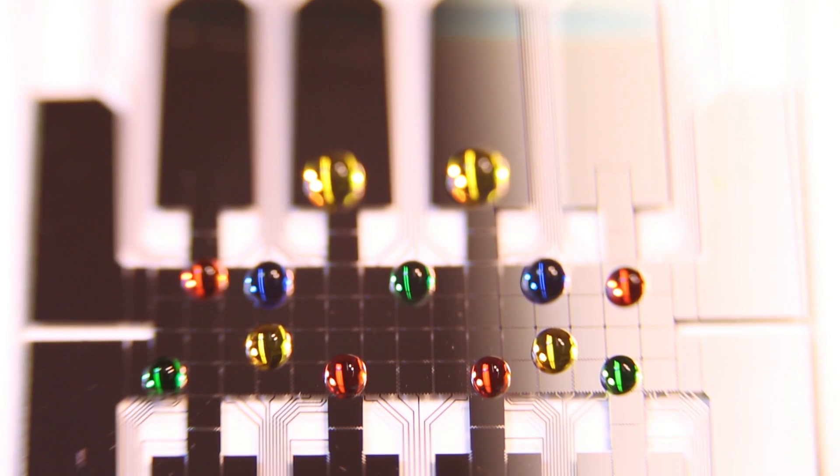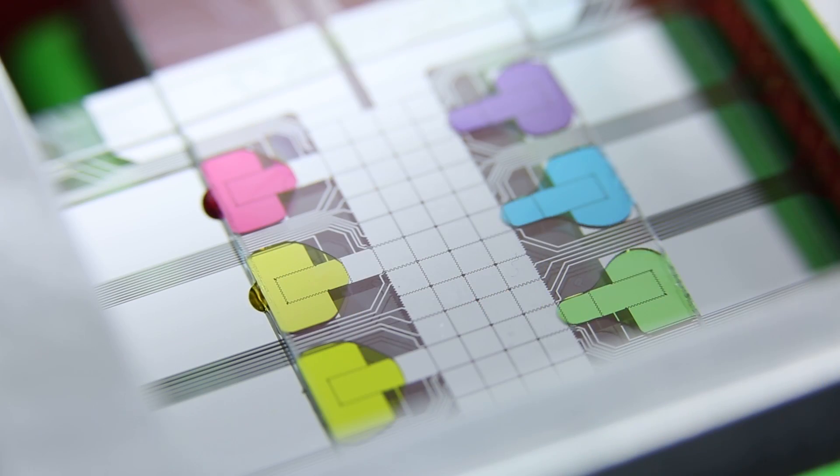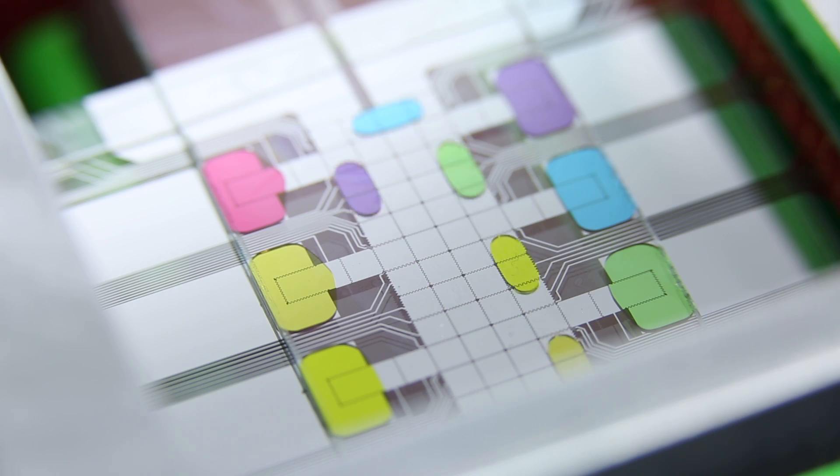Effectively creating a lab on a chip. At the core is a technology called digital microfluidics, which allows us to move tiny droplets of liquid using electrostatic forces.